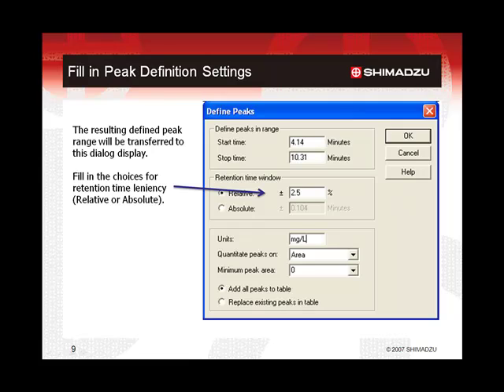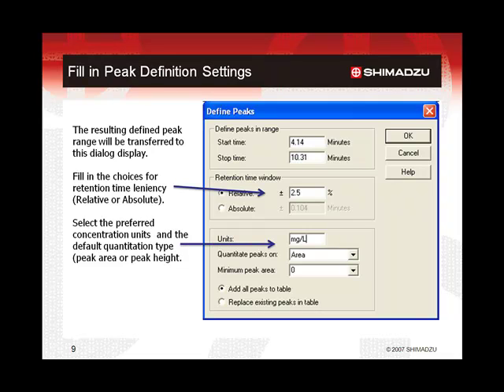With either selection, the window width can be overwritten by the user in the peak table. It is also possible in this display to make an entry for the default concentration units for this set of defined peaks. This should be set to the same concentration units that will be used for the calibration standards. It is also possible to make a selection of the default quantitation type — the choice is to use either peak area or peak height for determining the peak response. These settings can also be made in the peak table. Lastly, the defined peaks can be added to the peak table automatically. If the method already contains peak information, pre-existing entries for matching peak times can be replaced if desired. Clicking OK closes this display and updates the peak table automatically.